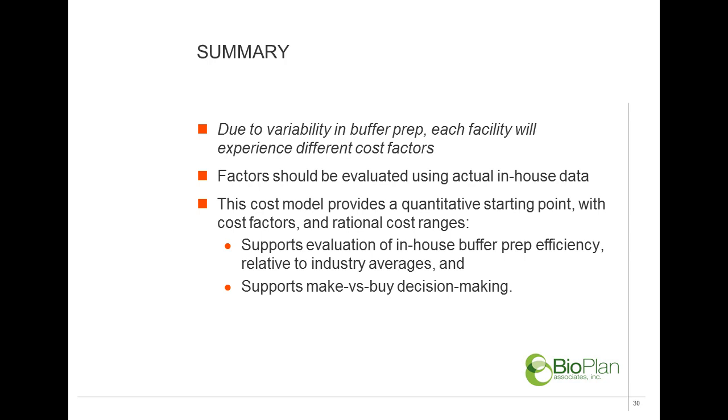On the other hand, if you're in the middle of an urban area and facility space is at a premium, then you might even go beyond the range and say, even though I don't have the exact number, it's probably higher than this because I'm in the middle of a particular region. So by taking these numbers and ranges, you can use that model and develop it into something completely customized for your facility. And that alone is, I think, very valuable in supporting that make versus buy decision.